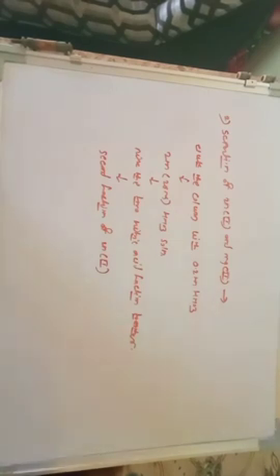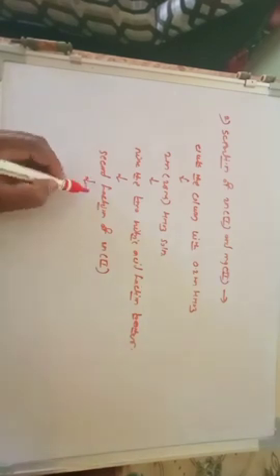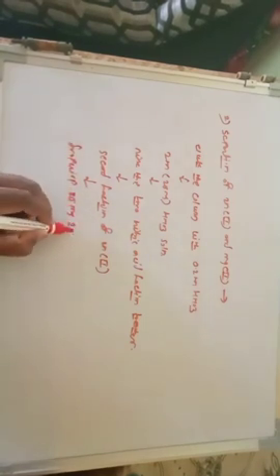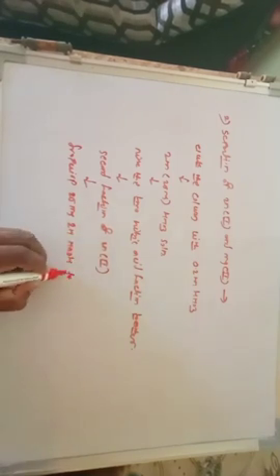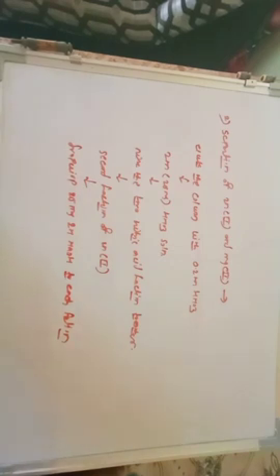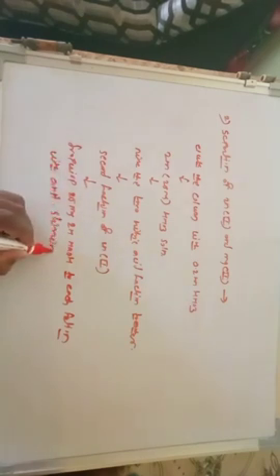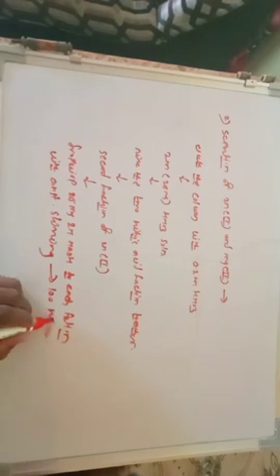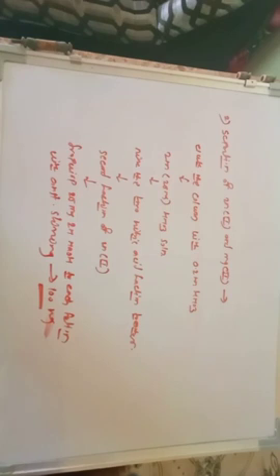So the last step is what? You have to add dropwise 25 ml of 2 normal NaOH solution to each fraction, that is, the fractions of both magnesium and zinc, with constant stirring, and dilute to 100 ml with distilled water in a volumetric flask.